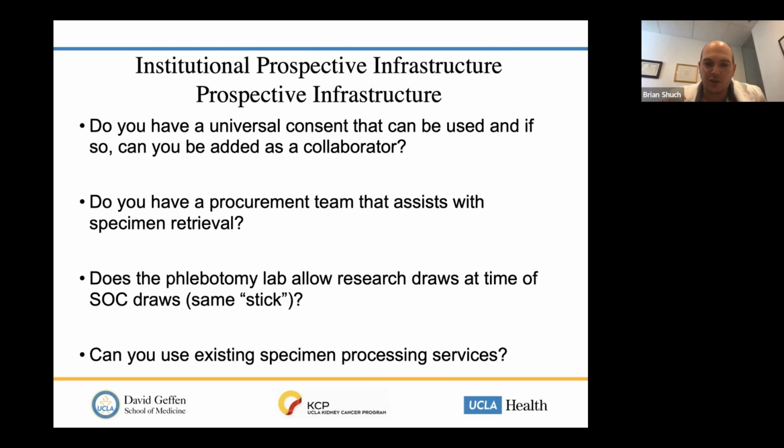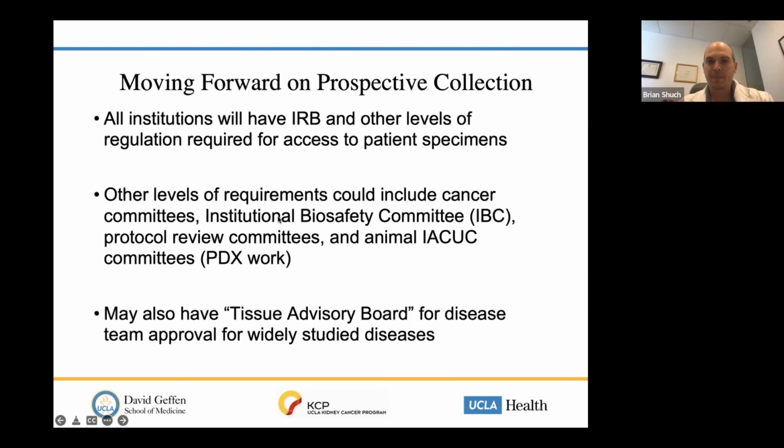And can you actually use the specimen processing services? If there's a clinical trial team processing blood, can you just give them the specimens rather than hiring someone yourself? Again, don't reinvent the wheel.